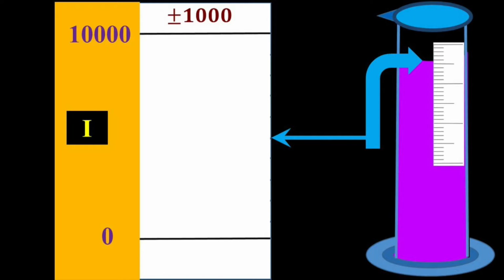because you know that the small gradation is 10,000s place, and then you see that space there between the 0 and 10,000. That's going to be mentally broken up into 10 places. So 10,000 divided by 10 would be thousands place. So the precision is thousands place. So what does that mean? Well, thousands place, what that means is that the smallest place value that's going to contain a significant figure will be thousands place. So the smallest place value that will contain a significant figure for this instrument, is what the precision means, will be thousands place. So watch.